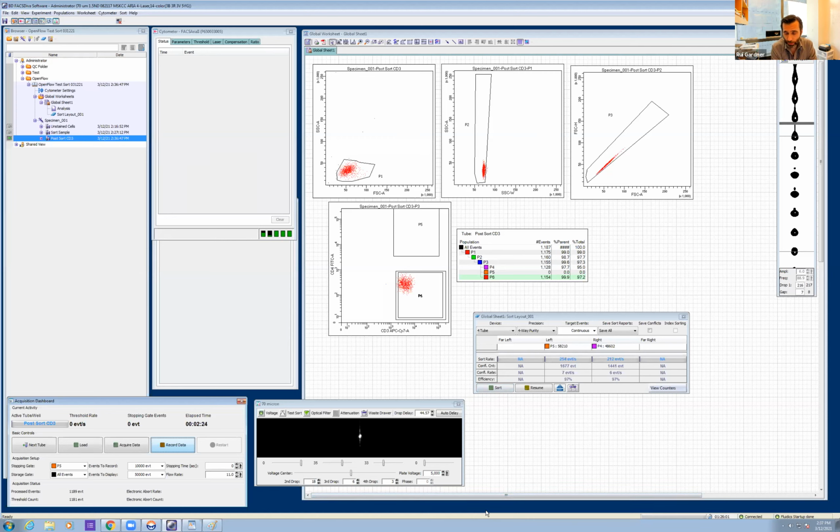There's another question here. If sorted cells are very diluted, do we need to concentrate them? For instance, spinning them down or removing liquid to count them? If yes, could this process affect viability? I wouldn't manipulate the cells in any way if I was wanting to count them, because when spinning, you are going to lose cells.